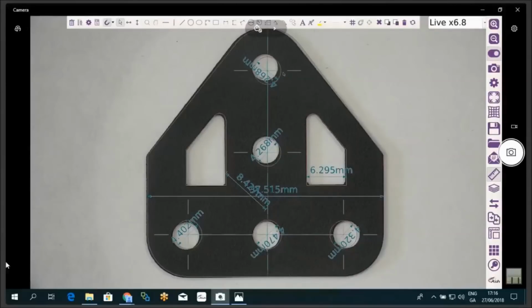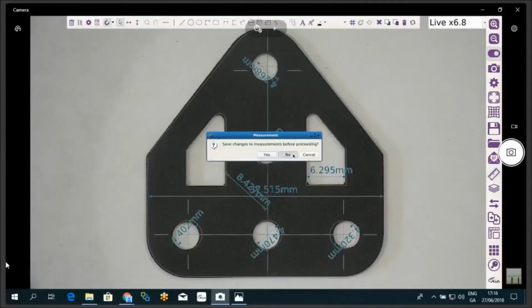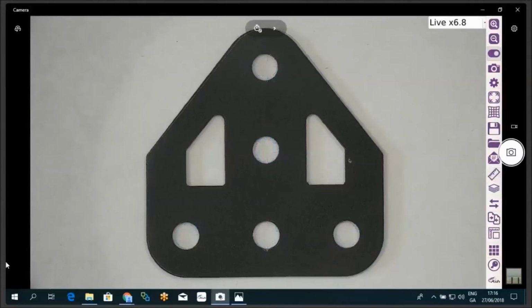And this file can then be used further in the automatic measurement app. It actually comes in as a vector, so the objects are movable and editable. So that sums up the 2D measurement, automatic measurement, and DXF apps, which are some of the most powerful on the system.